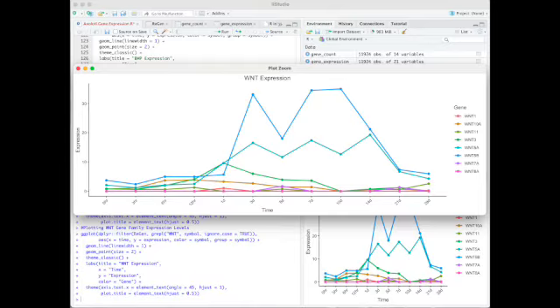At 1 day, we can see an increase in many of the genes, while WNT5A and WNT5B have high levels from day 1 to day 21. This could correspond with the pathway's initiation in blastema formation and signaling of the limb regrowth. A complete limb regeneration takes about 40 to 50 days in juveniles, so we can see through this motion towards cell differentiation and limb growth is beginning to occur around this time, when the genes have increased in expression.